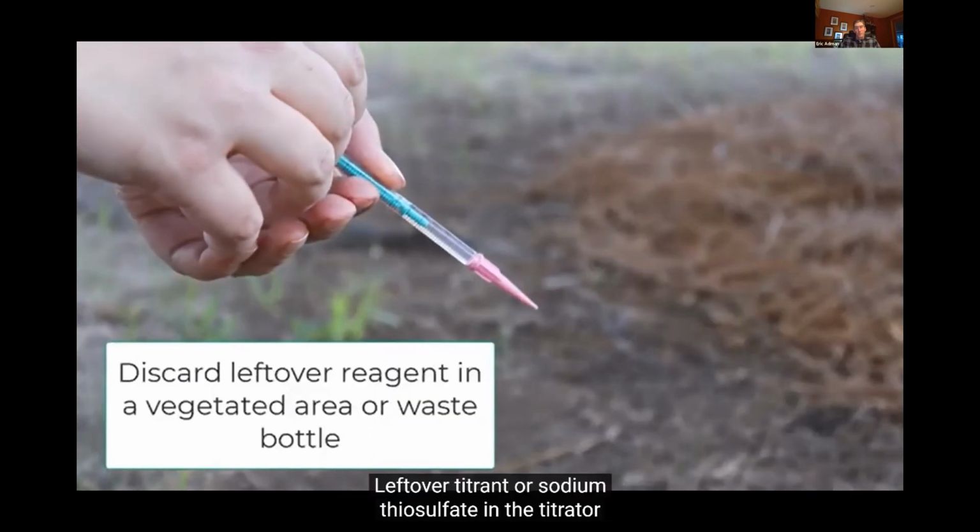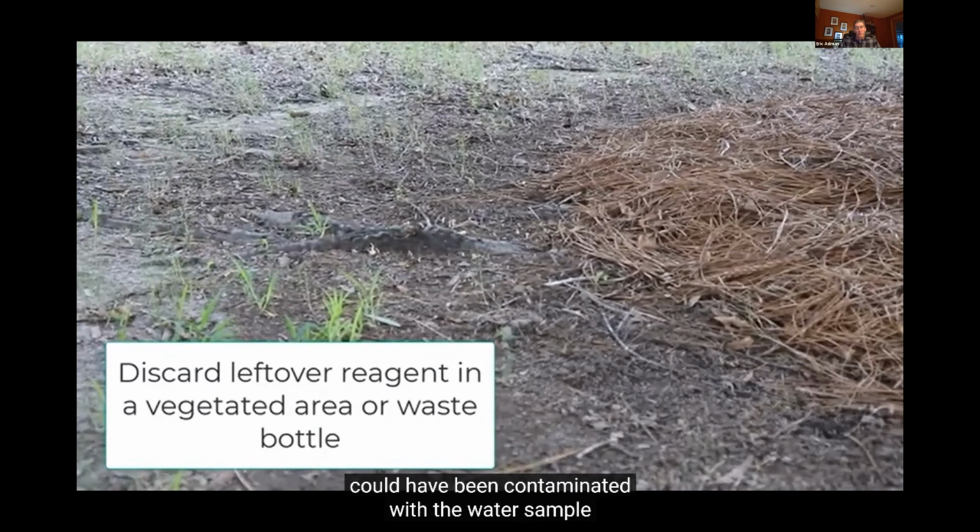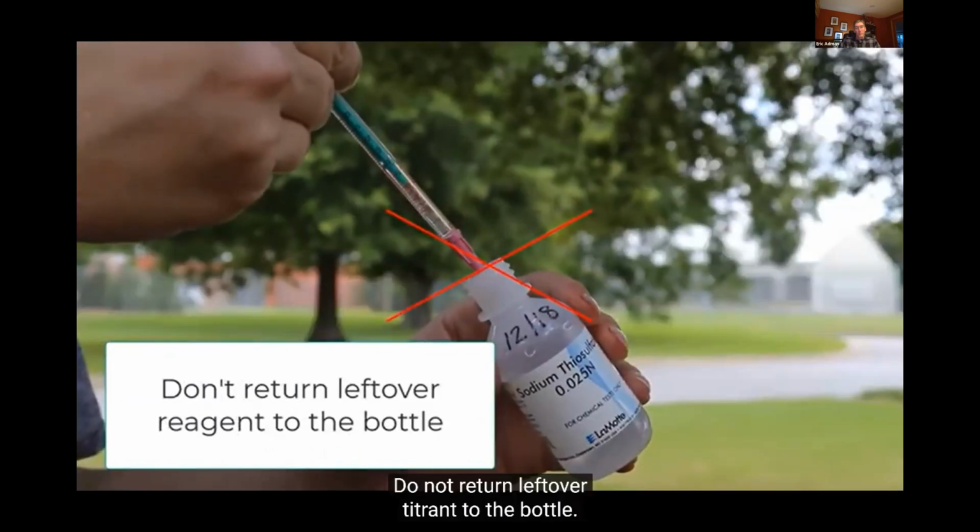Leftover titrant or sodium thiosulfate in the titrator could have been contaminated with the water sample and should be discarded. Do not return leftover titrant to the bottle.